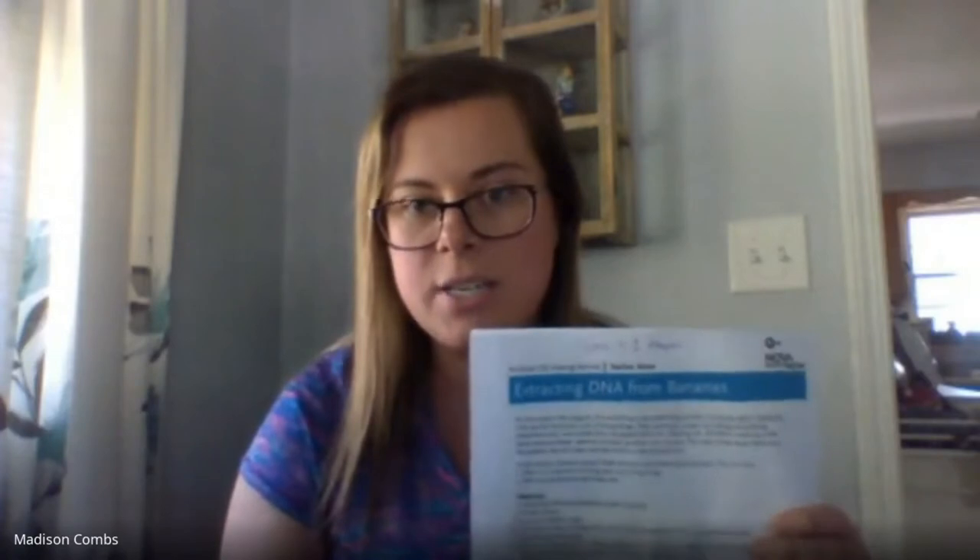Hello everyone! My name is Madison Combs and I'm at Jeffersonville High School doing the after-school GEAR UP. Today we're going to be extracting DNA from bananas. This is pretty neat. You can use items that you have at home — a banana works great, but so do strawberries, blueberries, and even your own DNA.